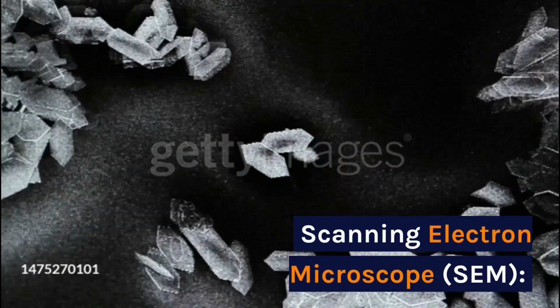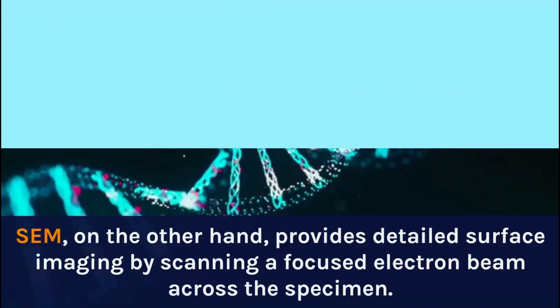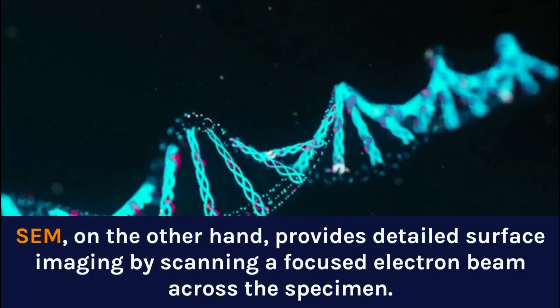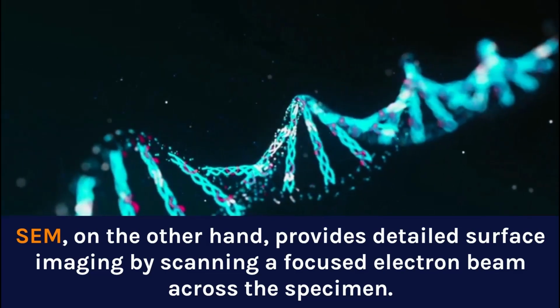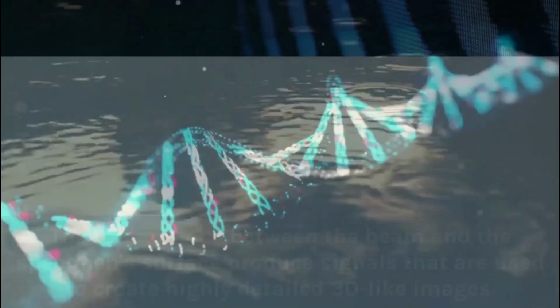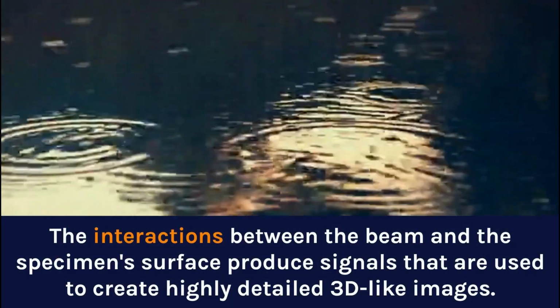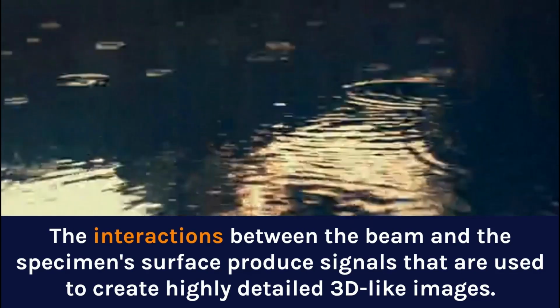Scanning Electron Microscope, SEM. SEM, on the other hand, provides detailed surface imaging by scanning a focused electron beam across the specimen. The interactions between the beam and the specimen surface produce signals that are used to create highly detailed 3D-like images.